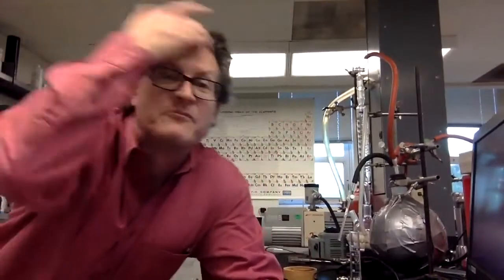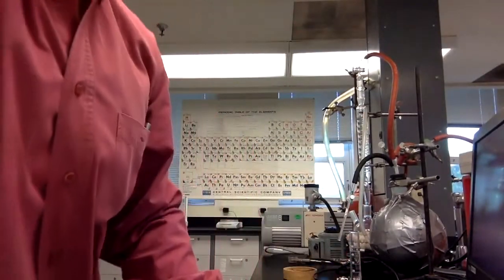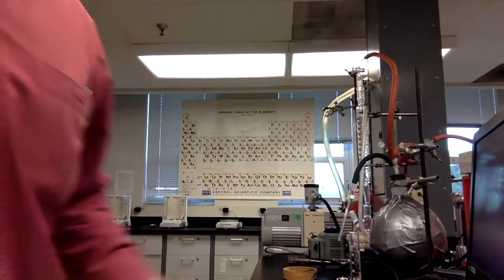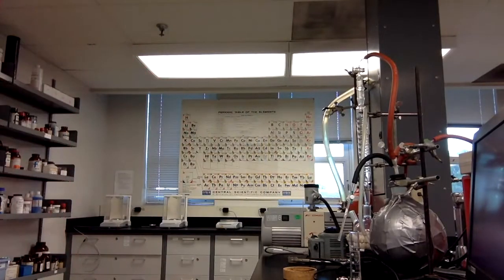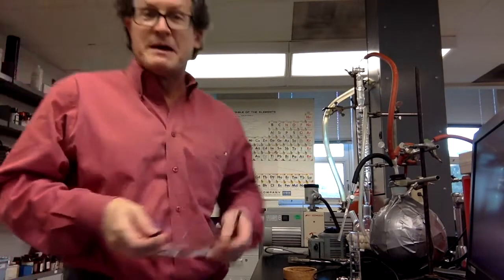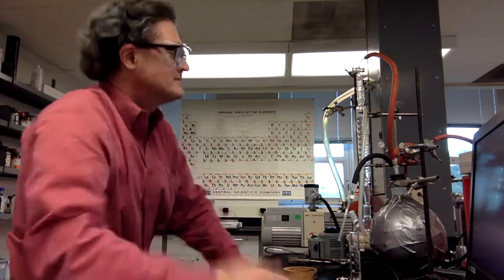We want to somehow measure the equilibrium vapor pressure of 2 different liquids, ethanol and n-heptane. And so how are we going to do that? Well, we need some apparatus for that. Proper safety equipment, as always, and we're going to need a vapor pressure apparatus.